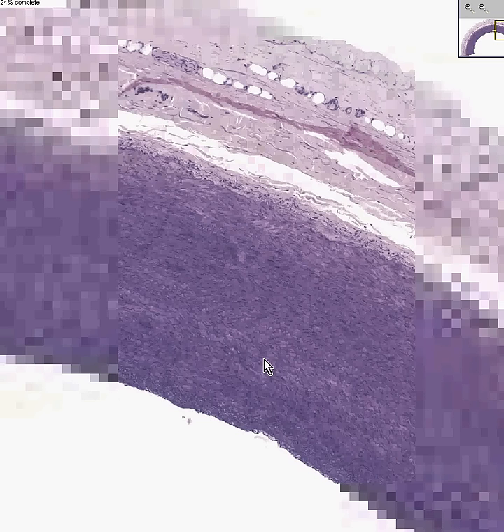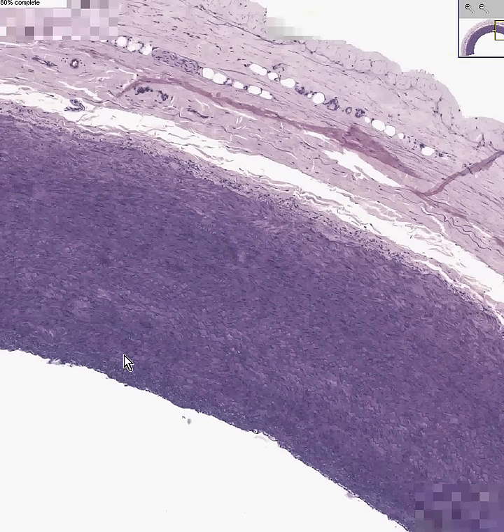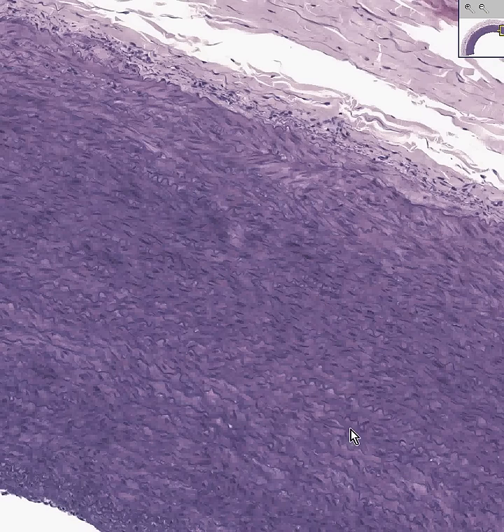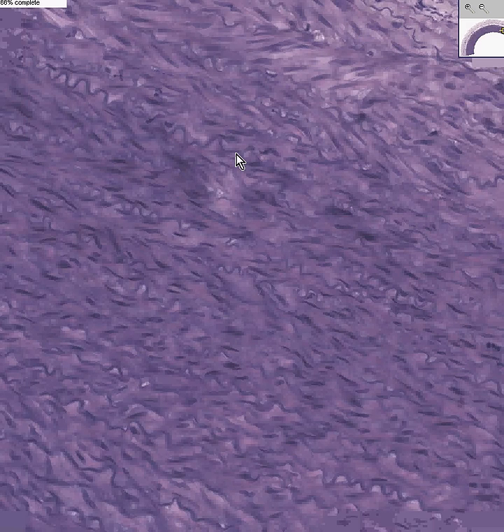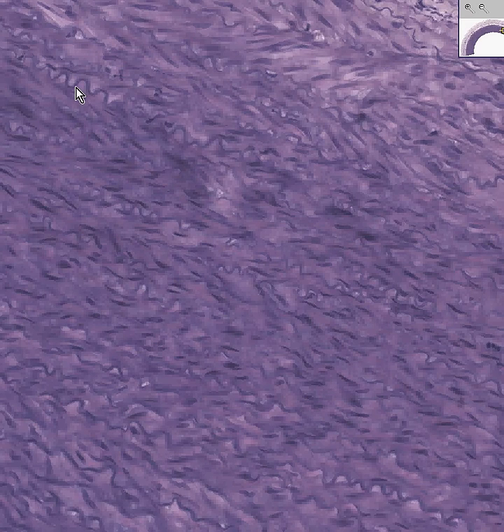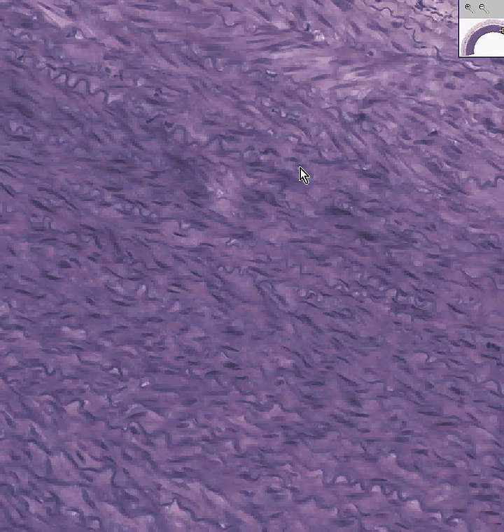So if you zoom in on it, you will see that this blackish area is very, very rich in elastic fibers. And elastic fibers are these nice squiggly things that you see all around here. And if you remember, in the regular H&E stain, the elastic fibers looked quite lighter than the surrounding smooth muscle. In the elastic stain, which stains elastic dark, the elastic fibers are very dark and squiggly. And that's why the whole media looks so dark.